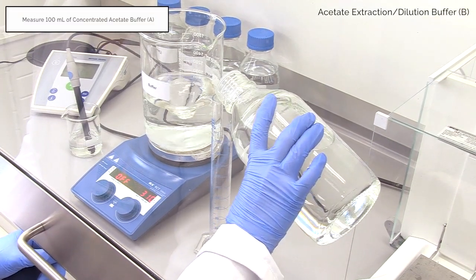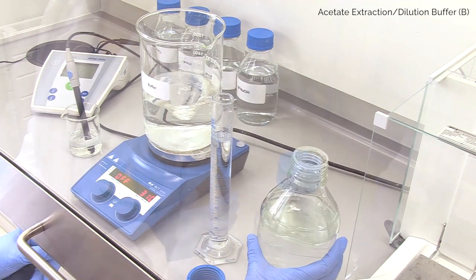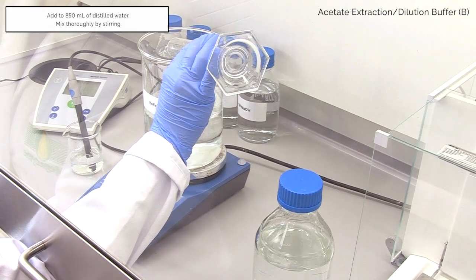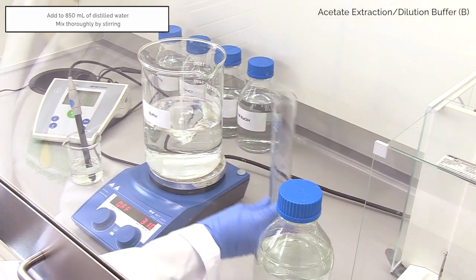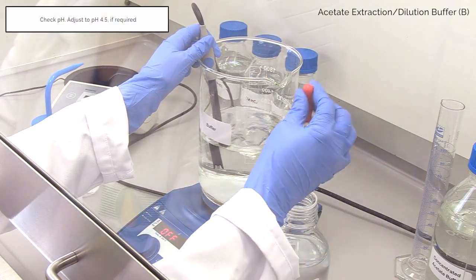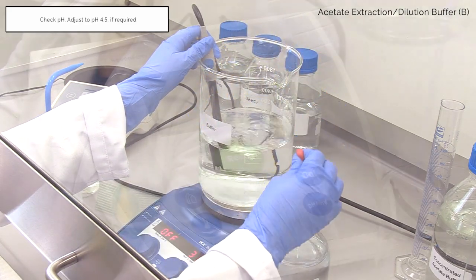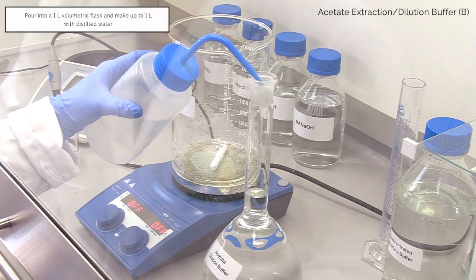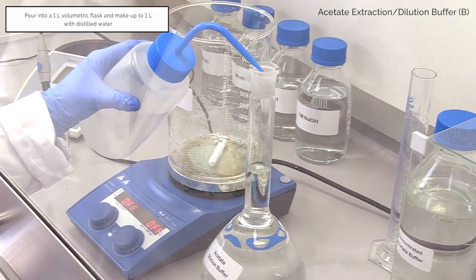Measure out 100 millilitres of concentrated acetate buffer and add to 850 millilitres of distilled water in a stirring beaker. Check the pH and adjust if required using 1 molar NaOH or 1 molar HCl to pH 4.5. Pour into a 1 litre volumetric flask and make up to 1 litre using distilled water.